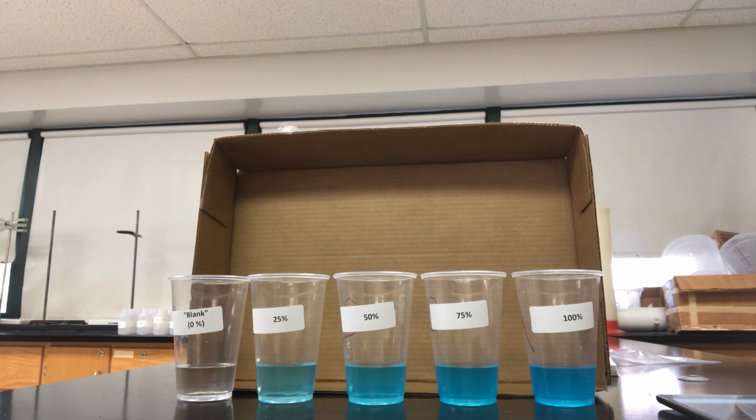So that's the purpose of the lab that you missed, and now you're watching the video. We want to pass a red light through these blue solutions, measure how much red light comes through, and then make a graph. From the graph, we can get a line of best fit, and from that, you will get an equation. Using that equation, you should be able to determine the concentration of any other solution of Cool Blue Gatorade, depending on whether or not it's between about 25 and 100% concentration.